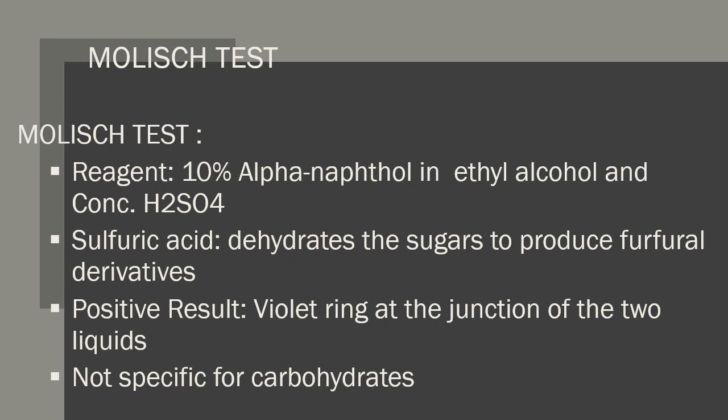Your Molisch test utilizes 10% alpha naphthol in ethyl alcohol, and of course concentrated sulfuric acid.